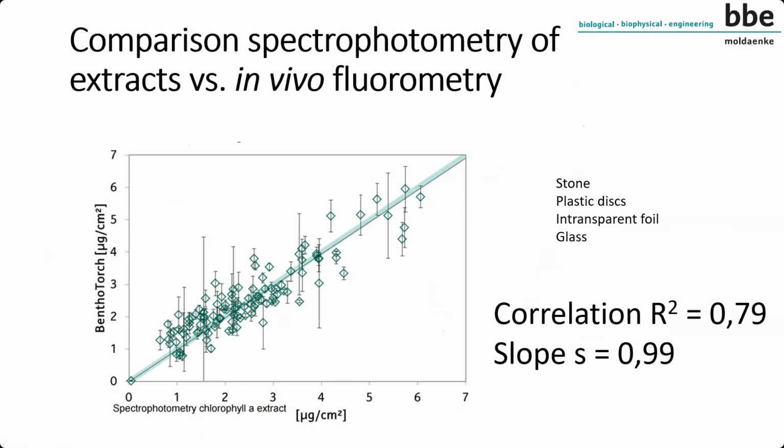There are some reasons why it might not be identical. And of course, we have to deal that these methods are quite different. But I mentioned to you that also the different way of taking the samples, transporting them, subjecting them to extraction, and so on, can also change something in the comparison and make it not that clear that we have such a good correlation. And this is, of course, also reported in the literature. Sometimes you see that it works quite fair, and sometimes it does not work quite good. Sometimes we can find an explanation, but not very often. But I can show you some reasons also for that.